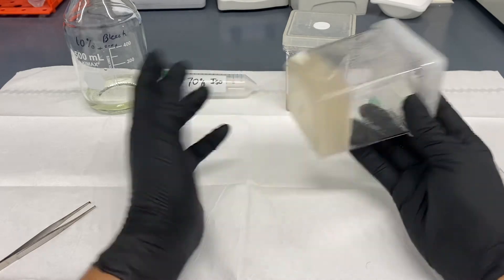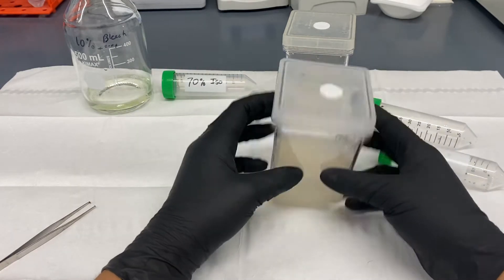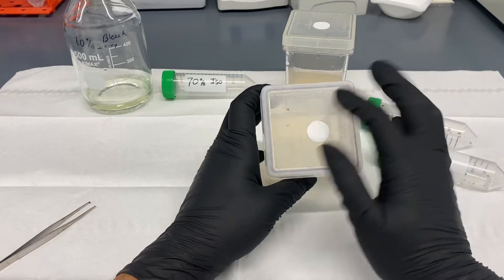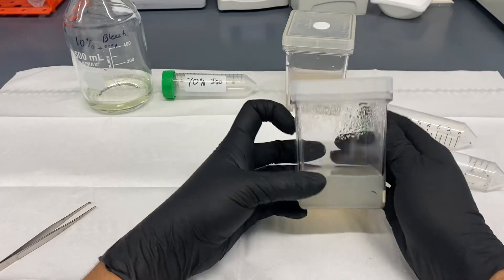You can change the amount of agar depending on how solid you want it to be and that will change the growth. Also you'll see these have a vent on them. Normally you will not see a vent on them, that just also changes the type of growth depending on what you're looking for.